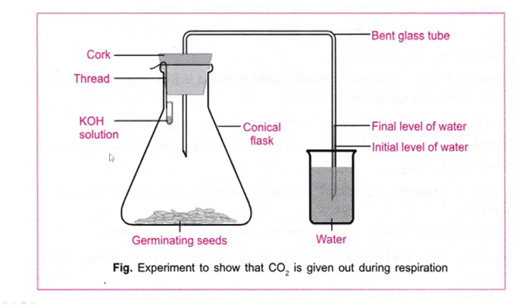We have a simple experimental setup. We have a conical flask containing germinating seeds. Inside there is a small glass tube with a freshly prepared potassium hydroxide solution. The conical flask has both the germinating seeds and potassium hydroxide inside. There is a rubber cork sealing the flask so that gas cannot come from outside and gas cannot go outside — it is a sealed system. This is the experimental setup.